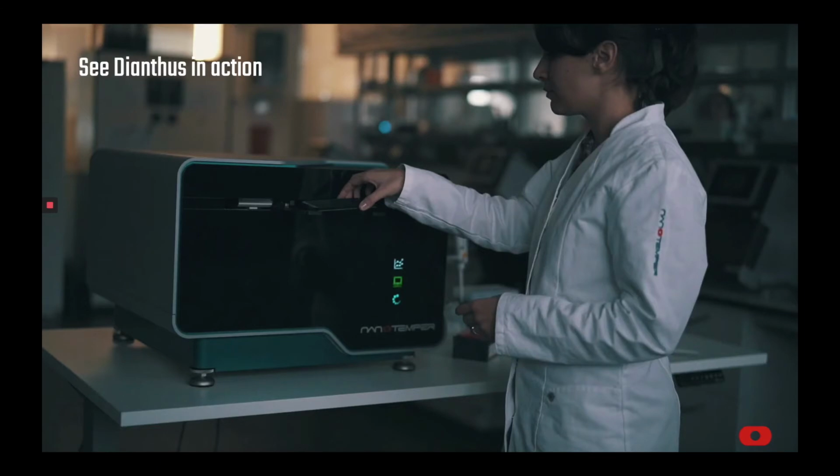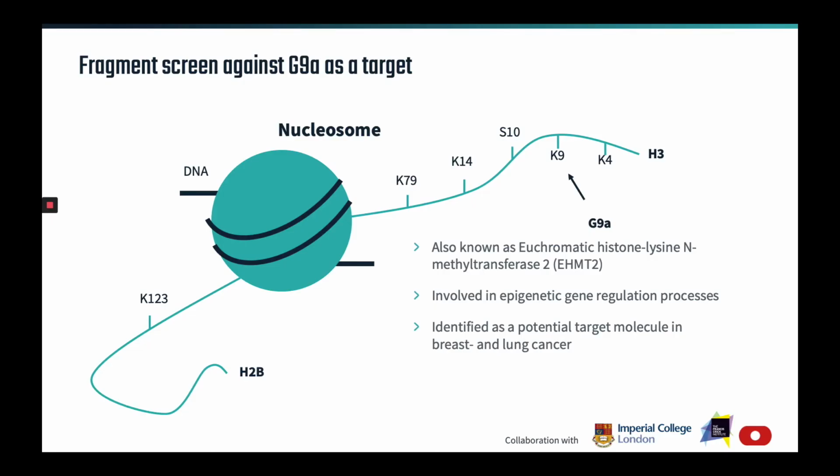So let me show you one example of how Dianthus is used and the data that's generated with it. In this particular example, we're looking at fragment screening against G9A as a target. G9A, for those of you who don't know, is a methyltransferase that methylates lysine residue 9 on histone H3 and has been shown to be involved in epigenetic gene regulation. G9A has also been linked to several diseases including breast and lung cancer and has therefore become an important target to study in drug discovery.